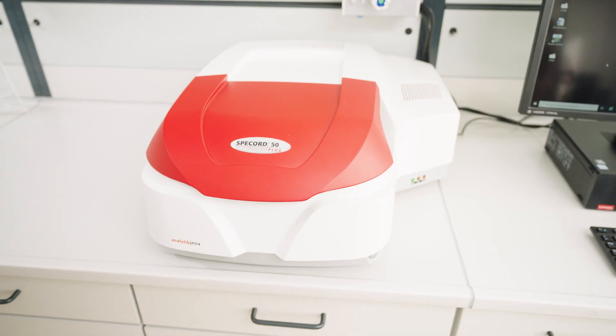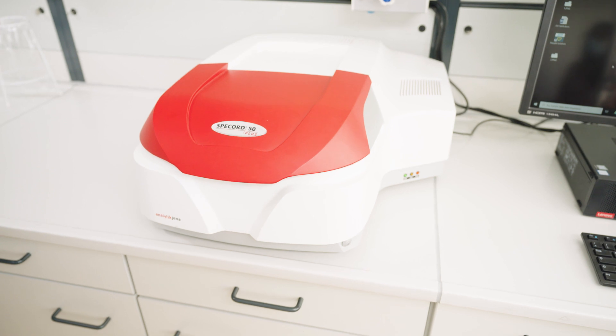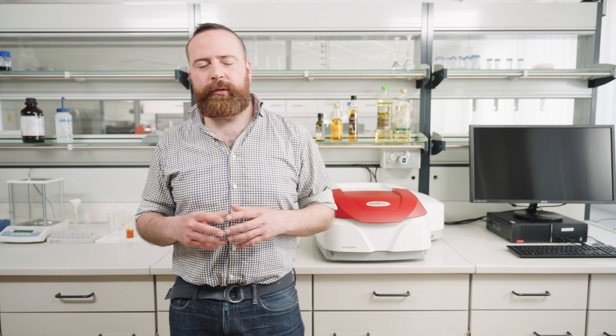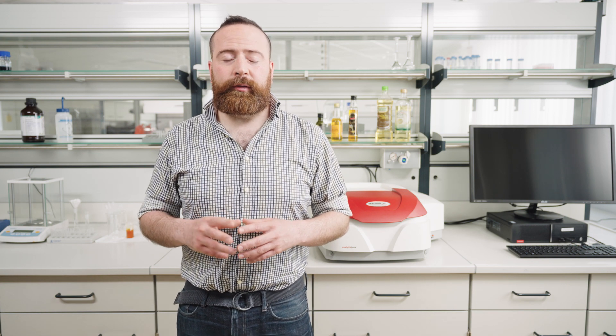UV-Vis spectrophotometry is a very diverse analytical tool. In contrast to element and combustion analysis technologies, UV-Vis allows a non-destructive qualitative and quantitative determination of molecules in the target matrix. Through the specific absorption of UV and visible light, your target molecule can be easily detected.